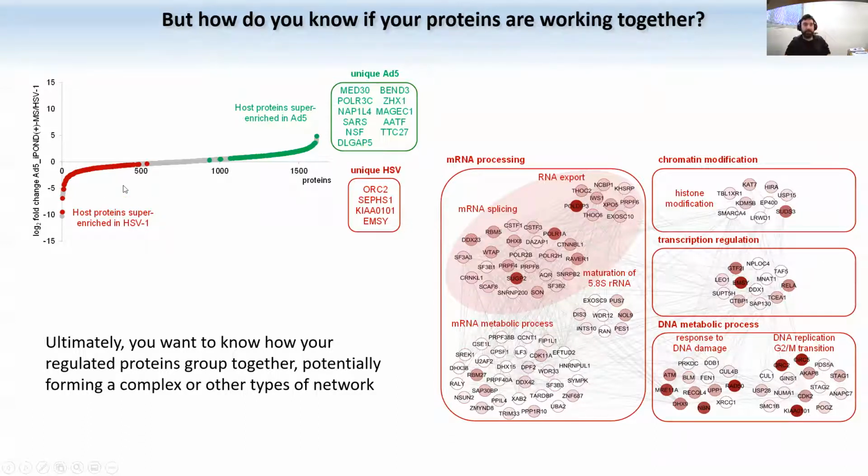And here, you can actually create these networks using other types of software that don't necessarily tell you the biological function of a protein, though they tell you that too. Their main job is to tell you how we know that these proteins have some sort of genetic or physical interaction. Physical interaction means that they are touching each other in the cell somehow. Genetic interaction means that they're not necessarily physically touching, but one can affect the other, or they have some very common properties of some sort.